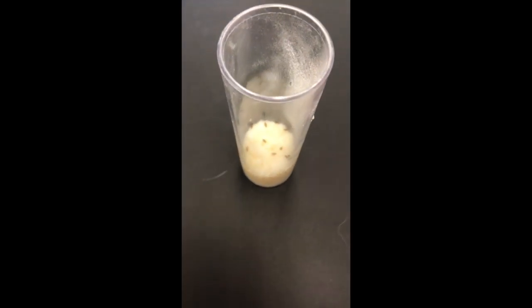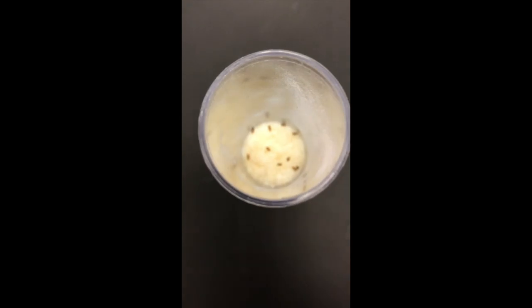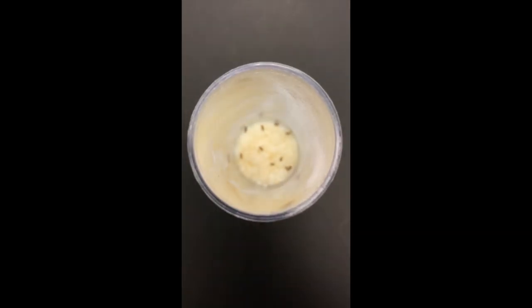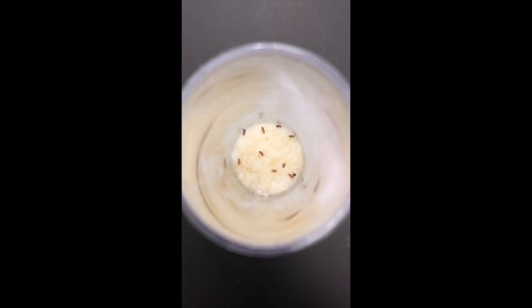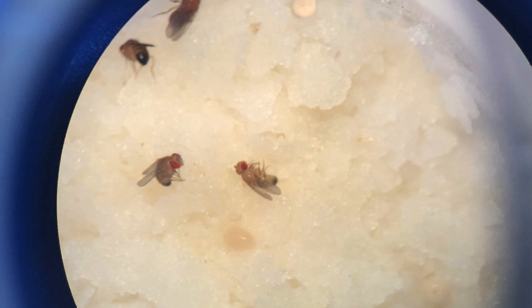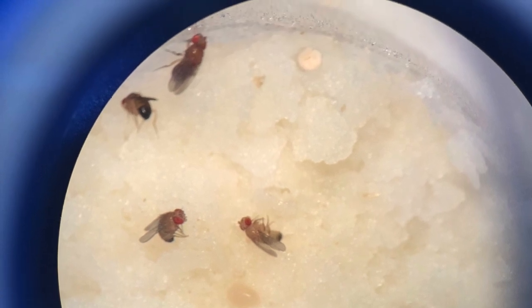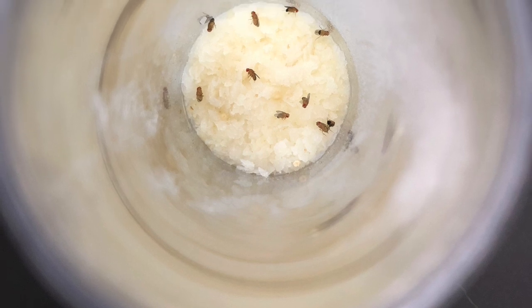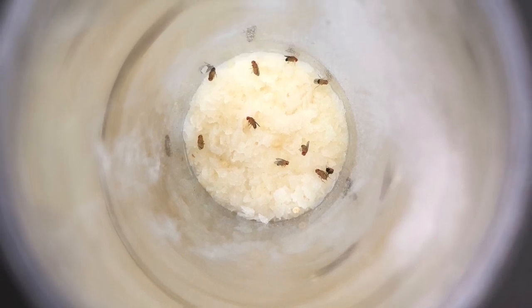Five male and 5 female flies were selected from the F1 progeny to be placed in the new test tube. Once the F1 flies were selected, the remaining flies were disposed of in an ethanol bath. This test tube was left for a 7-day period to allow the flies to mate and produce the F2 progeny.